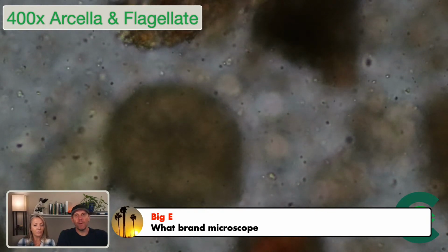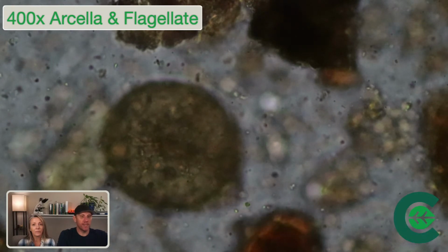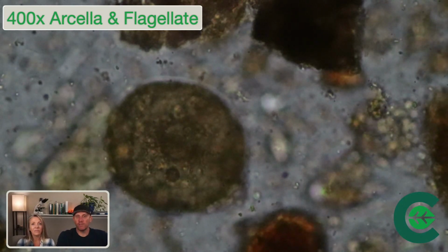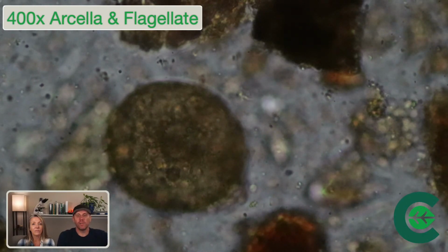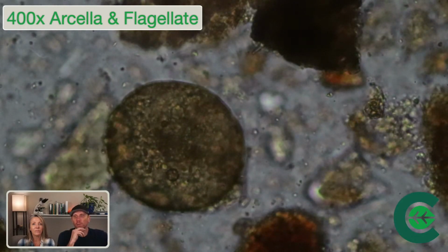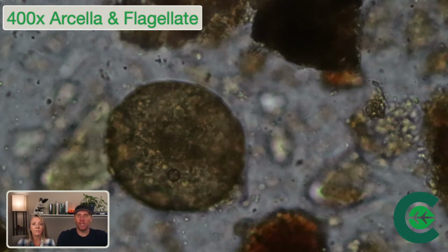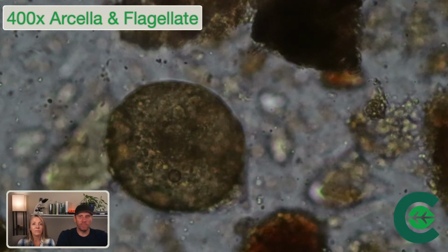We get a lot of questions about microscopes. We're going to be making a video. The one that's behind us here is a Meiji MT31, which does end up being about a $700 microscope, but it's been absolutely bulletproof for travel. If you're a Soil Food Web consultant that plans to travel to farms, that one was remarkably reliable for 2 years. But we're starting to find some other more affordable ones, and we'll make a dedicated video coming up in the next week, and we'll answer all that stuff really completely.